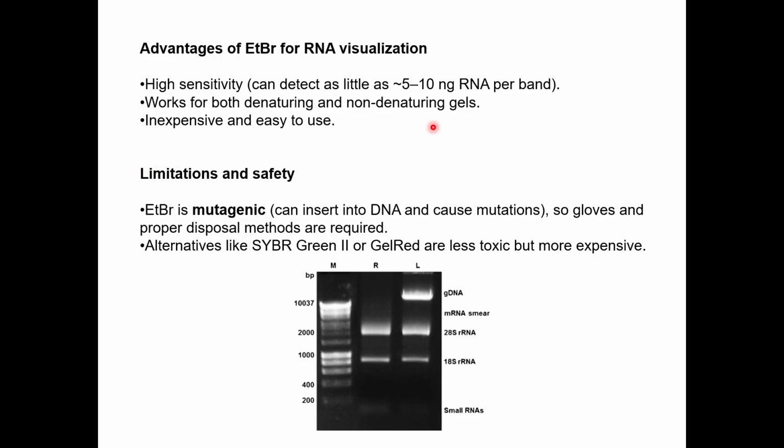It is inexpensive and easy to use. The limitation is, like I said, it is mutagenic. It can insert into the DNA and cause mutation. Basically, it's intercalating between the DNA. So even if you are exposed to it, it will intercalate into the DNA of your cells. So gloves and proper disposal methods are mandatory.